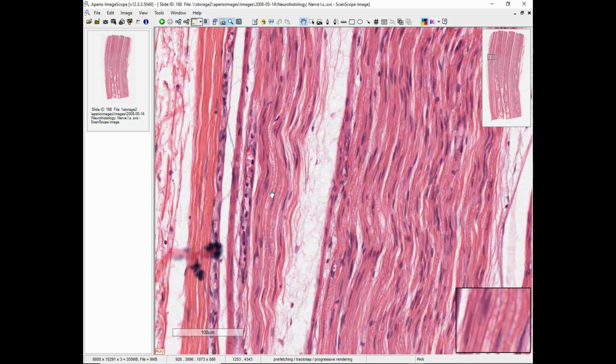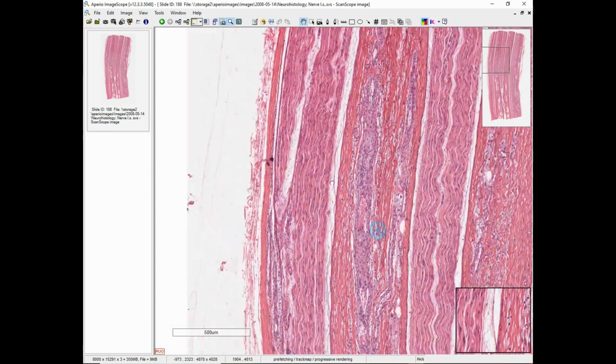And the myelin sheath contains a lot of fatty material, and fatty material is removed during staining, but sometimes leaves behind this foamy appearance. So this foamy looking stuff, right where I'm moving the cursor, is the remnants of the myelin sheath, and that little thread right in the center of it, that is the axon at the core of that sheath. We're going to now zoom back out.